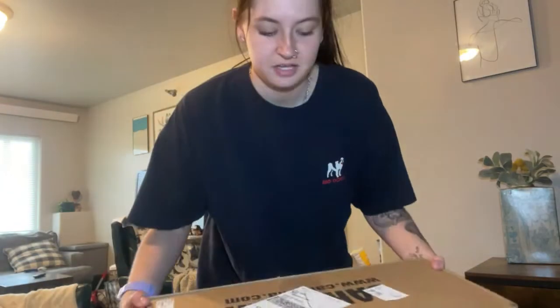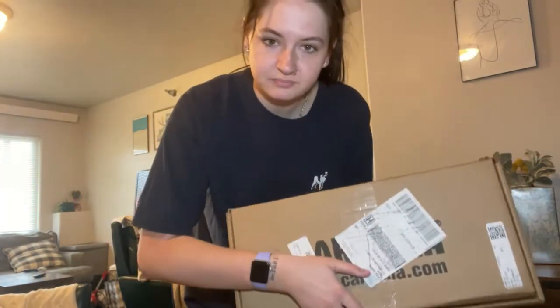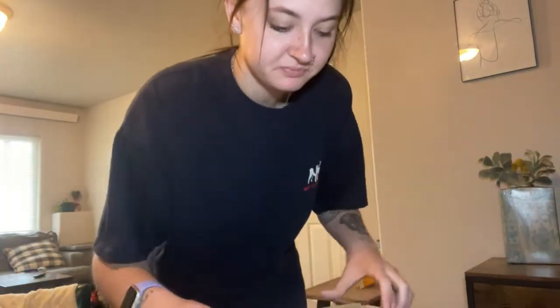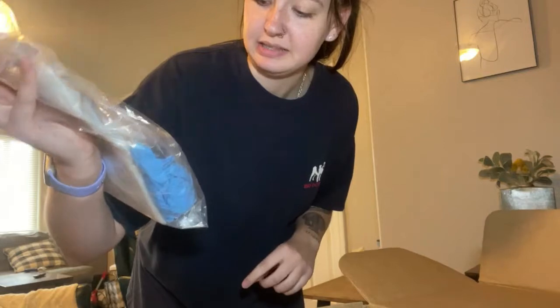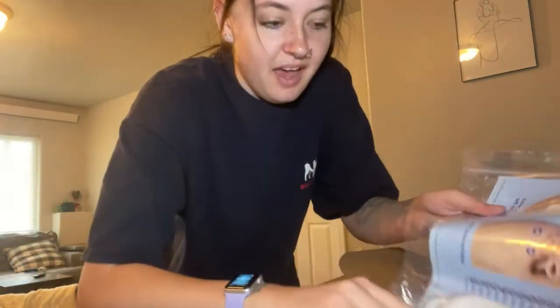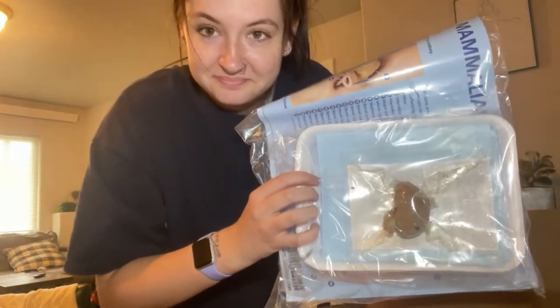So yeah, I gotta go grab it — they sent this to me in the mail. I got this box in the mail and a checklist of everything that I got. I got all of my tools that I need, like my goggles. I'm gonna wear a mask just because I know it's gonna smell. I got a kidney — a literal kidney. This is real. Can I show this on YouTube? I think so. This is for educational purposes. And I got a heart.